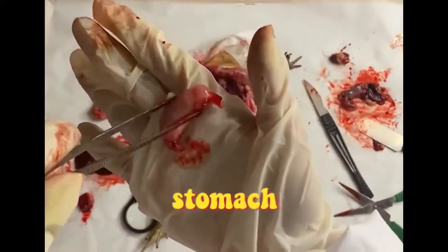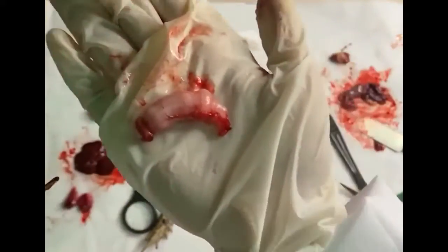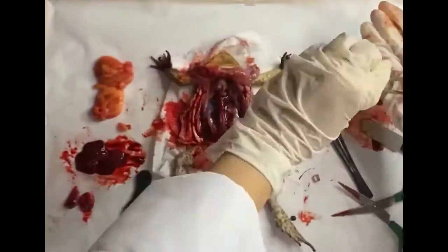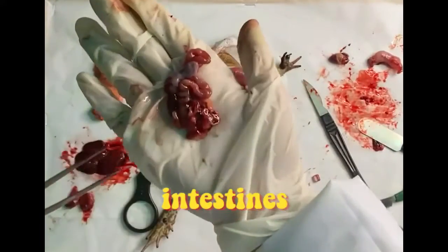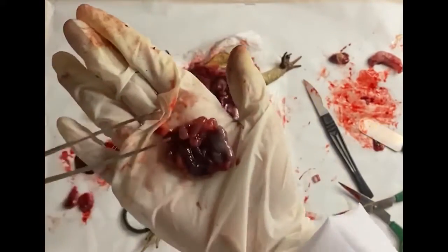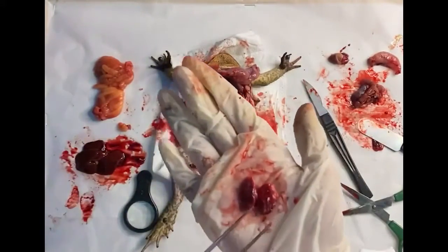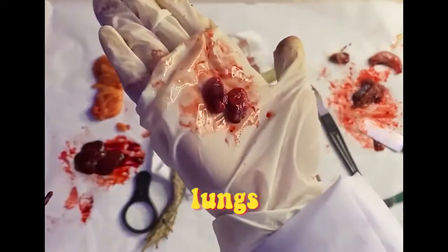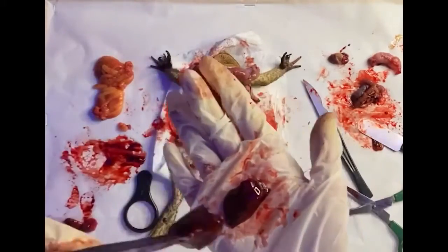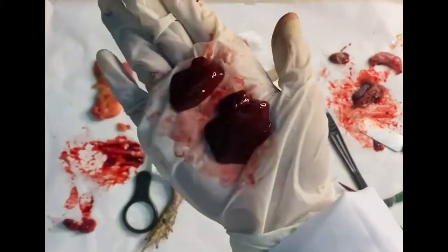This is the stomach. It began excreting some fluids when I placed it on my hand. Here are the intestines, small and large. Next, these are the lungs. They're quite small since they're deflated. And finally, the liver. The frog had two.